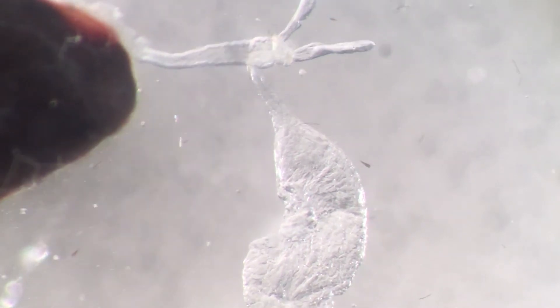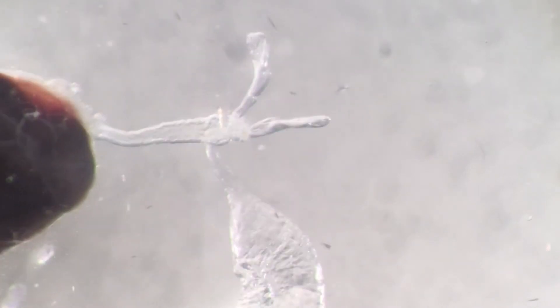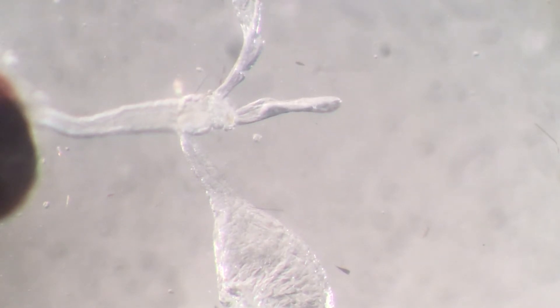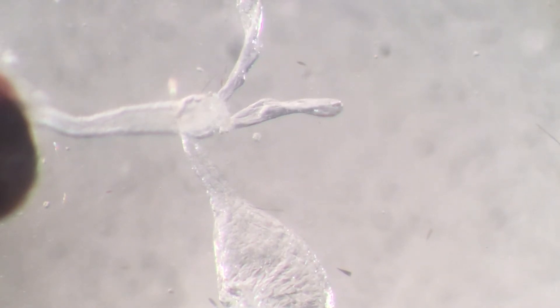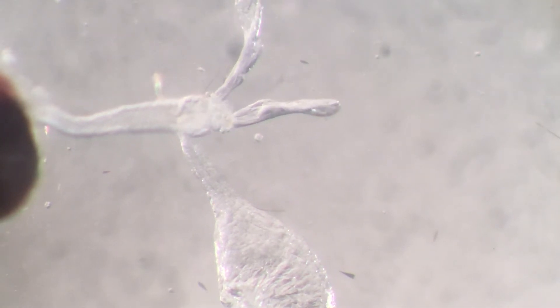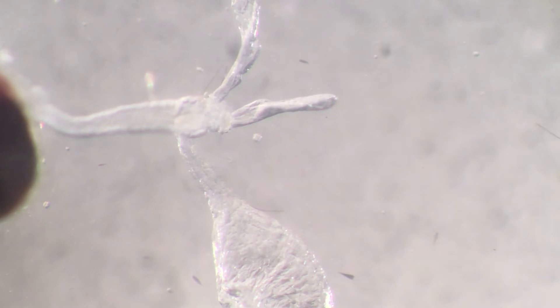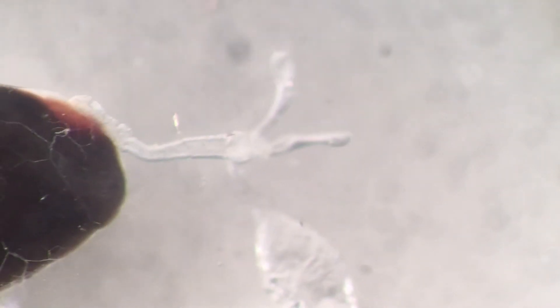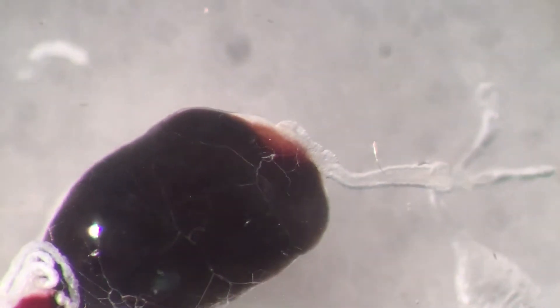Actually, I think what we are looking at is not peristalsis - I think this is part of the pump muscles that allow the mosquito to feed on blood. I think those are involuntary movements because, well, the insect was killed, but although the animal is dead, the tissue is still alive. That is effectively the midgut with the blood that has been digested.